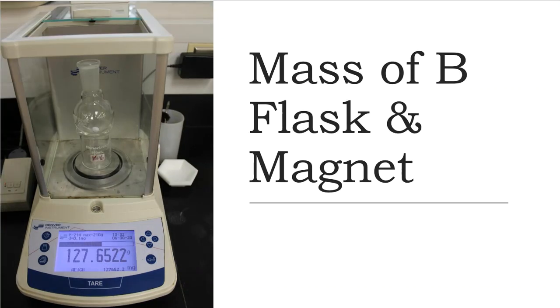All right, and then I put my boiling flask on it. The reason is because this is what's going to be involved in the reflux and the stirring and the reaction. And I'm going to put some stuff into that boiling flask. My 1-hexene is what I need to put in there. And I need to keep track of how much 1-hexene that I started off with for the laboratory.